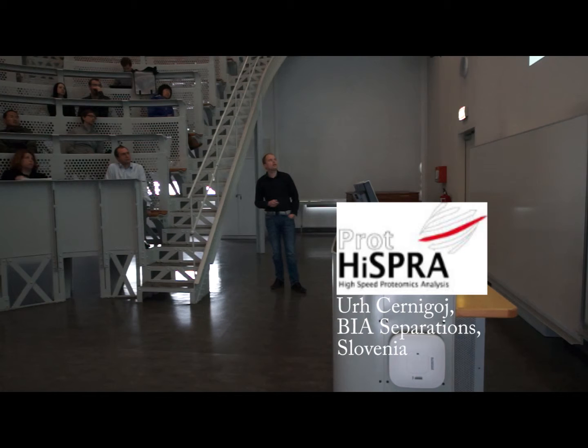On the blank column, before immobilization, there is actually no absorption. This is the dead volume. With the titanium dioxide-based column, we got around 4.5 milligrams of ovalbumin absorption per milliliter of the column. For preparative purposes this is still not enough, but at least we proved that it has quite substantial capacity for this protein.